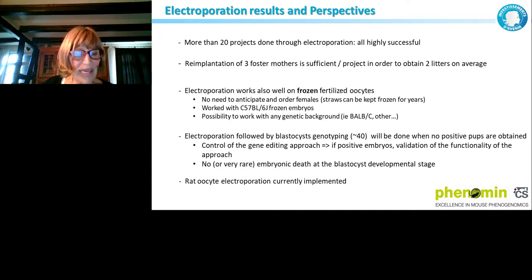And I have to say, approximately the same method also works with rat electroporation. We plan to write a publication saying you don't need to develop a completely different approach. It really works well for rat oocytes too.